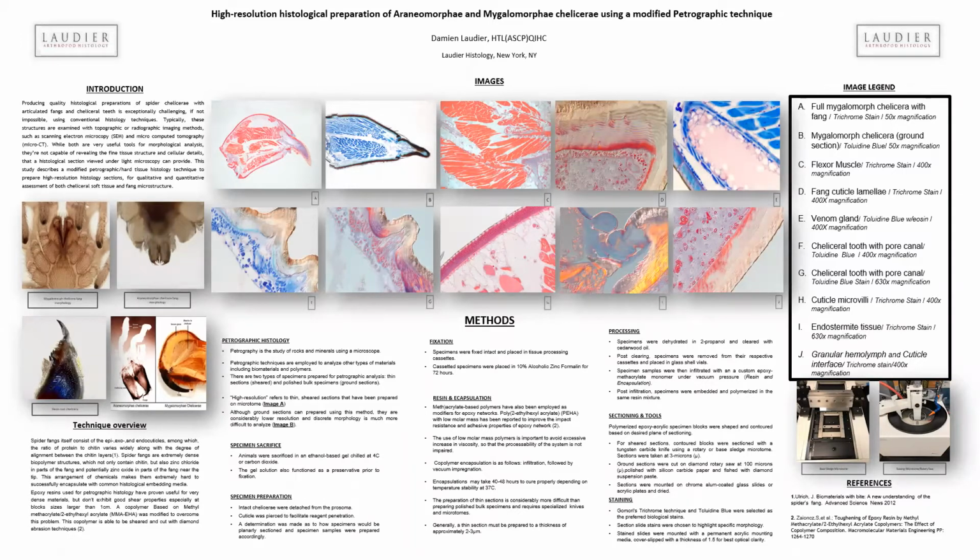Very nice. I know that you won the Jules Elias Excellence in IHC Award in 2019. So you must have a lot of very interesting and difficult techniques for showing the bone and the arthropods that you've shown. Just really gorgeous photos, and your photography must be amazing. But your technique that you show in the poster is a basic resin technique, but such beautiful staining that you have shown. And why is this topic something that was important for you to show?